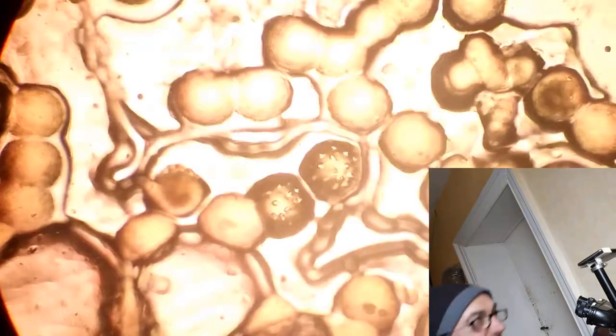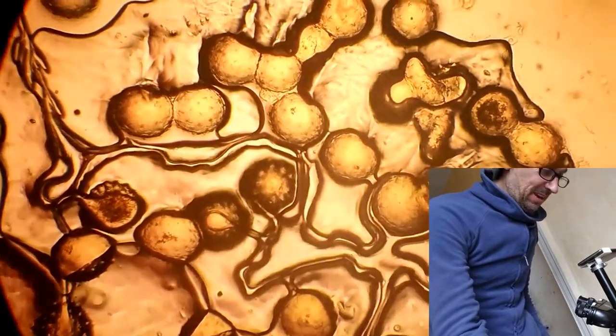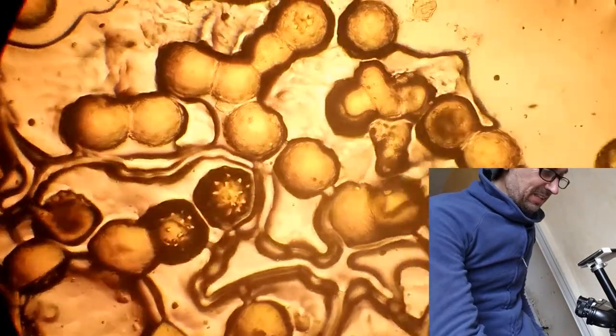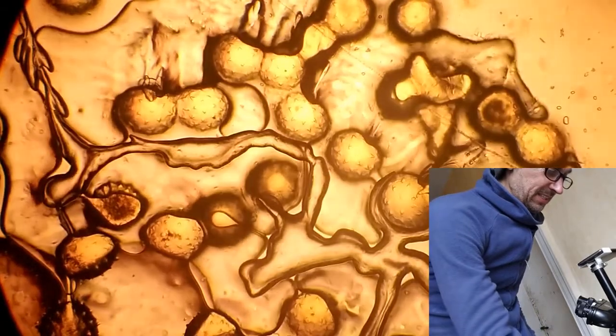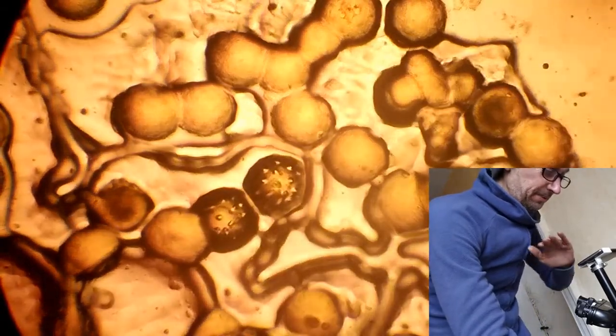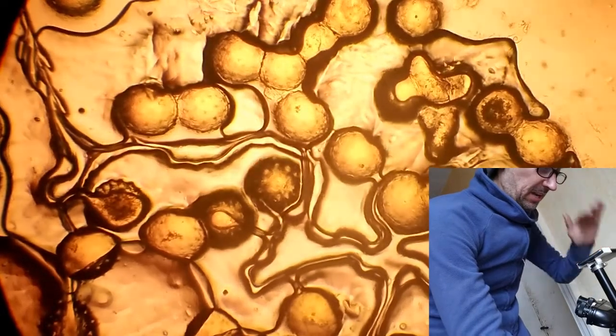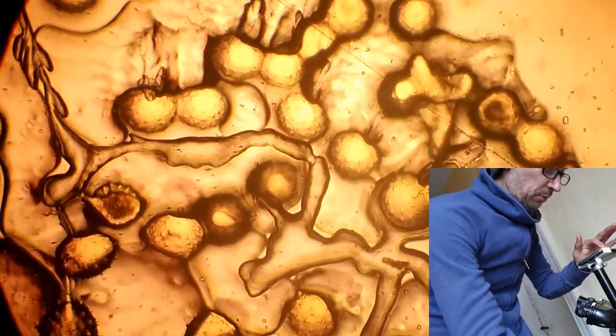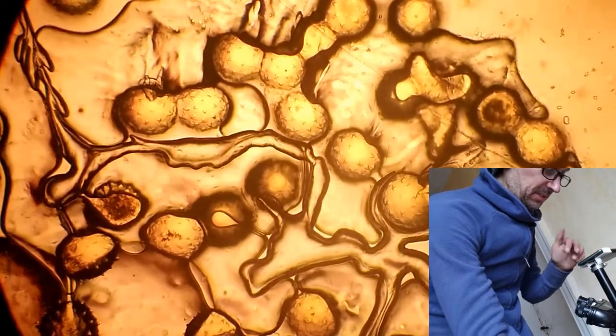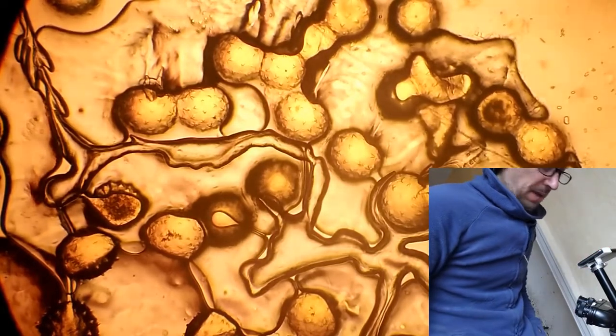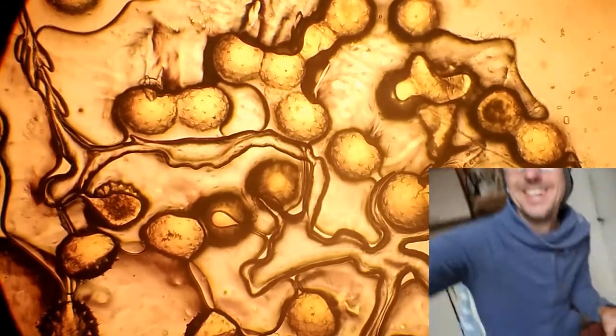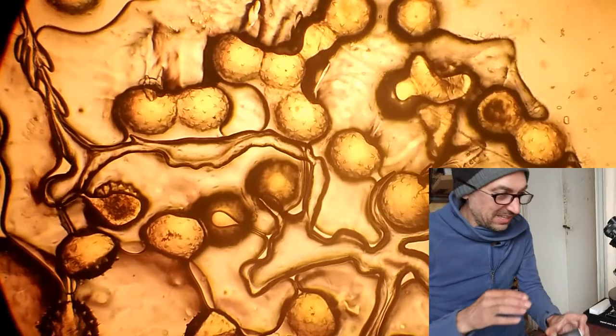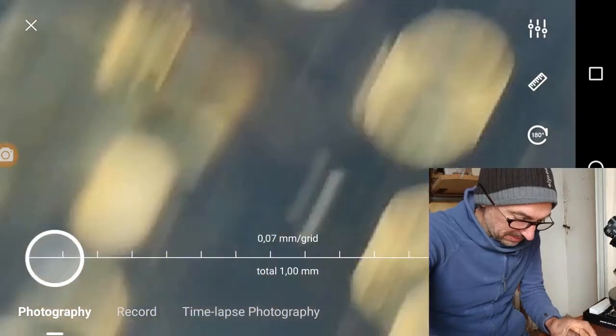Back to 10x - this looks rather like what the tiny scope does. Here you can focus different layers. If I change the height of focus, other pollen grains come into view. Every ball here has these spikes, whereas with the tiny scope it was not so clear.